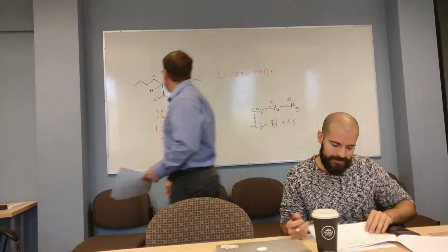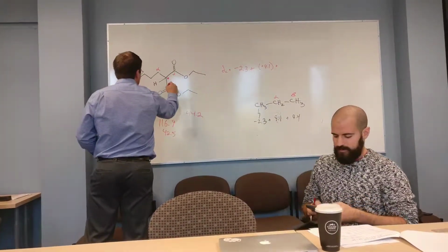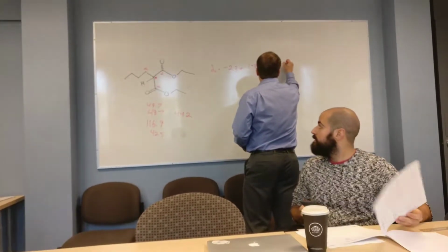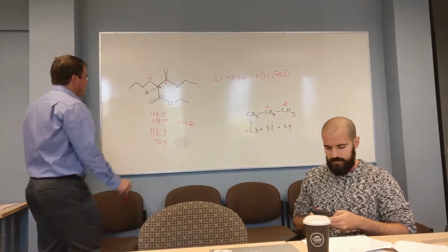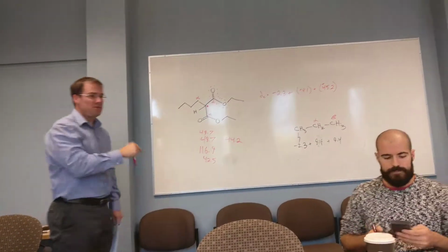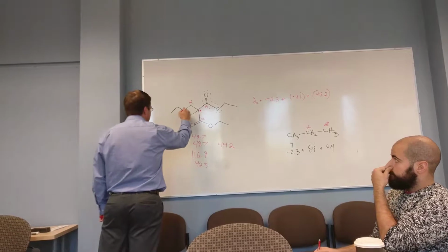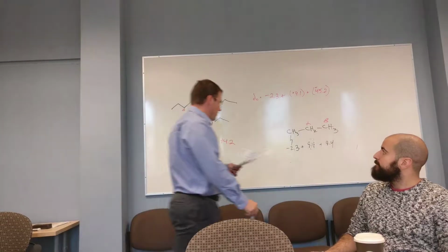What else do we have that's alpha to that carbon? So 2 CO2s is 45.2 in total. And those are alpha substituents. And this is confusing, that includes each of those two pieces, so we don't have to add the oxygen again twice. But we do have to take into account that there's also a beta alkyl group, which is plus 9.4.